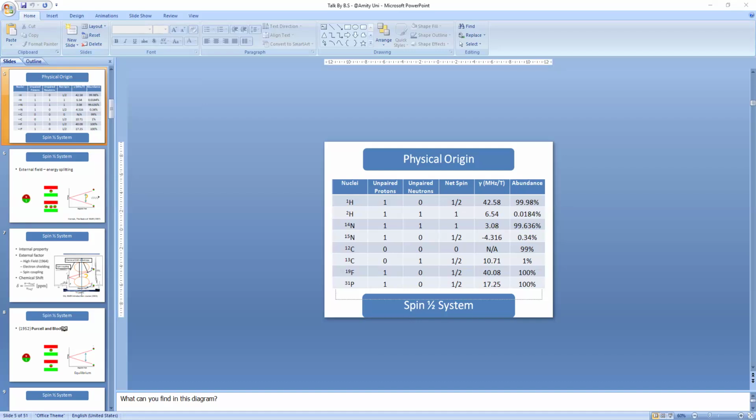And when we want to record the NMR signal, then what we will do, we will apply another field B1 that is generated with the help of software in the computer program, and that RF field in the form of RF frequency is sent to the probe, and that probe adds a new field B1 that is perpendicular, at a 90 degree angle to the Z direction, and we say that is a 90 degree pulse angle, and that shifts B0 to B1.